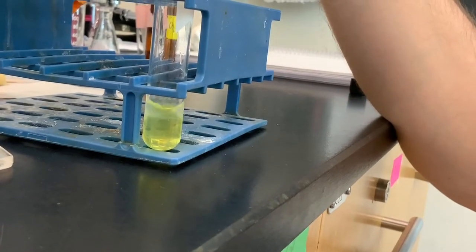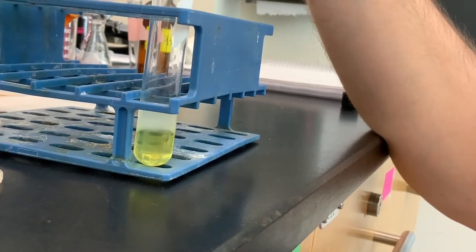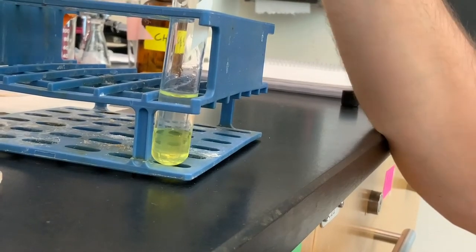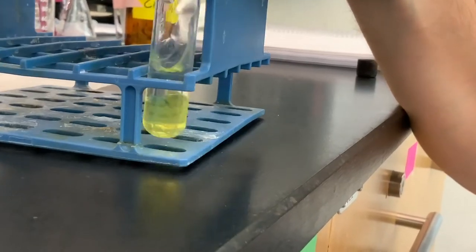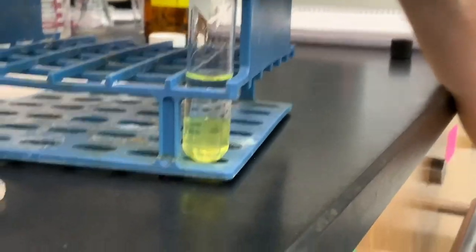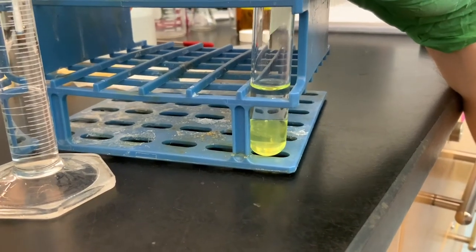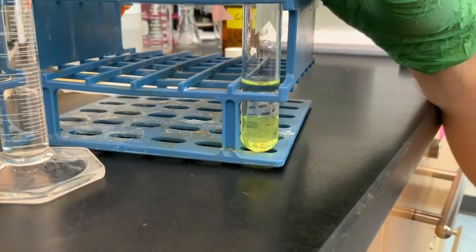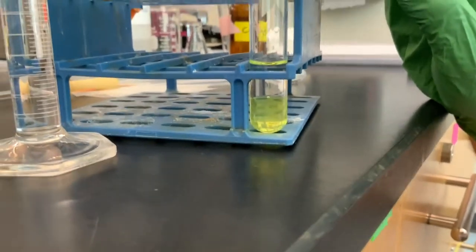we have 2 layers forming. We also already see something precipitating out, but then it goes away. And if the camera can catch it well enough, if I shake it just gently, you can see this effect known as Schlieren. It's a German word for changes in density, which happens when you've got changes in concentration of a solution. Even when you've got changes in density, like of air. So if you ever look at hot asphalt, you can see the air sort of waving. That effect is also called Schlieren.